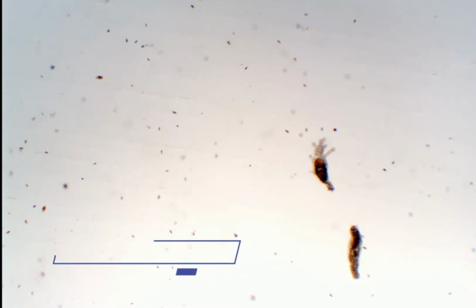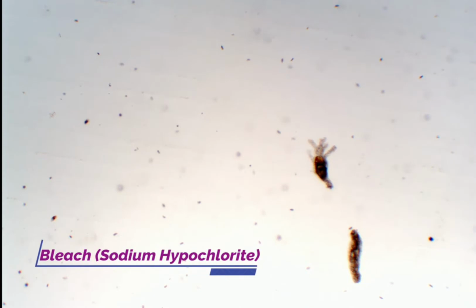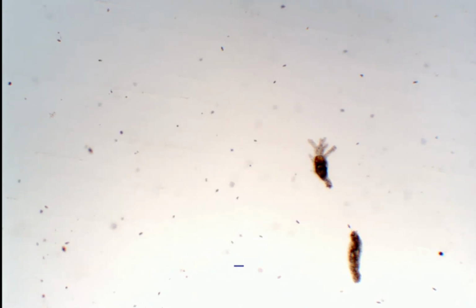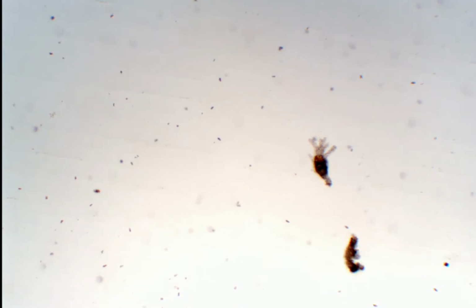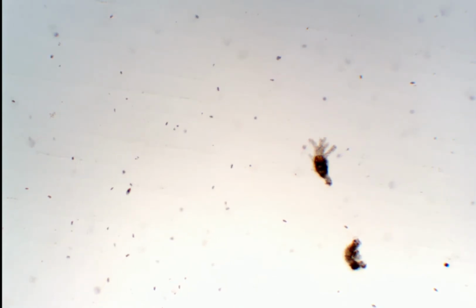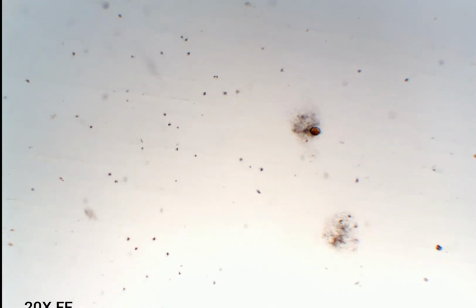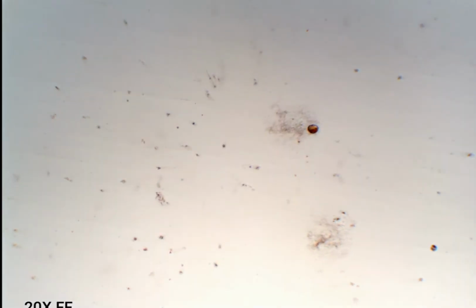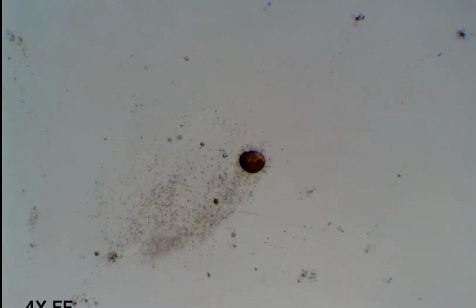This is how certain microorganisms react to different chemicals. Bleach instantly kills all bacteria, pathogens, microorganisms in the solution. It creates an exploding effect. And you'll see how their membranes will dissolve in bleach. There you go. There you can see their membranes dissolving in bleach.